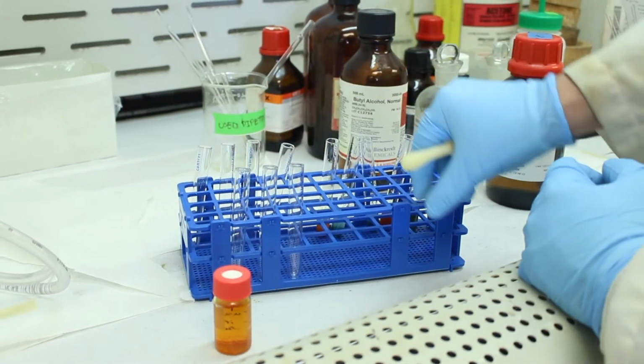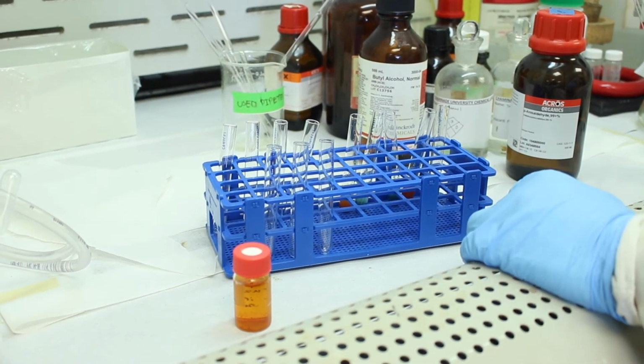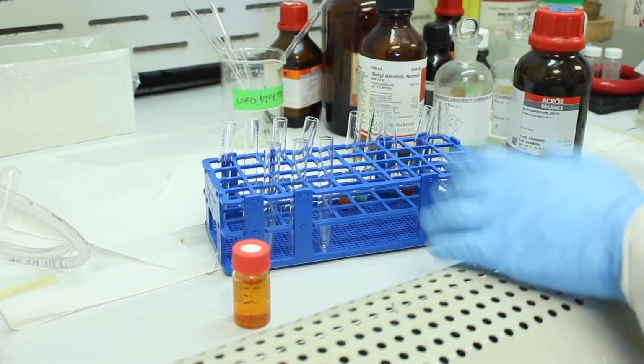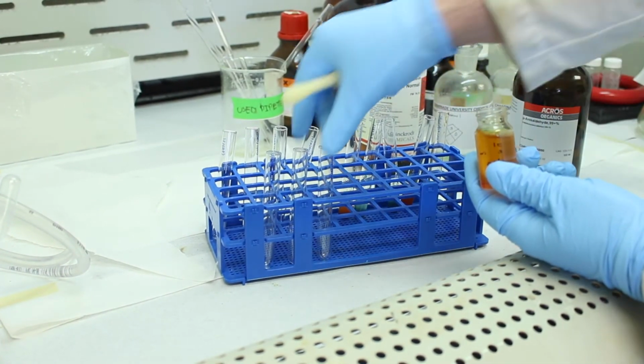For this test, you cannot use acetone as a solvent because acetone obviously is a ketone and the ketone will react with DNP. That will give you a false positive. So we can't use acetone as a solvent. Sometimes ethanol is used as a solvent, but for our purposes, we can actually just do it solvent-free. We can just mix this reagent with the compounds directly.